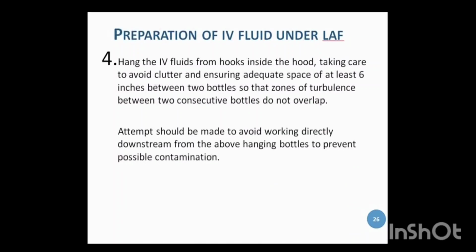Step number 4. Hang the IV fluids from the hooks inside the hood, taking care to avoid clutter and ensuring adequate space of at least 6 inches between two successive bottles so the zones of turbulence of one don't overlap with the other.